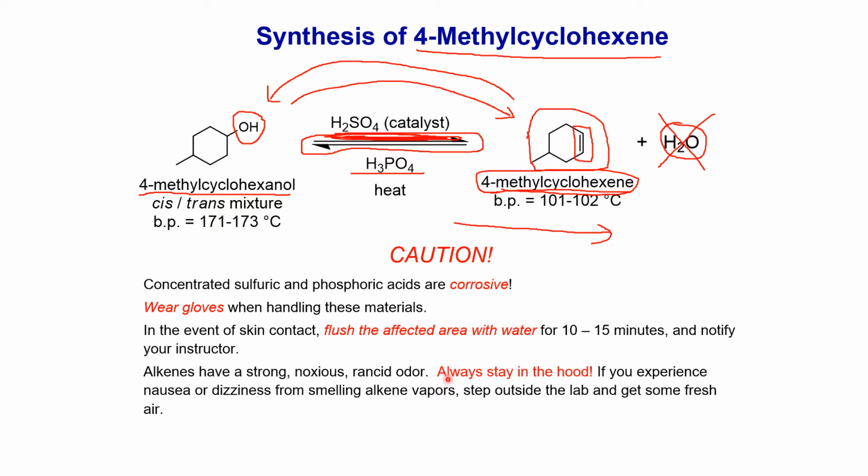Okay, so make sure to set up all the glassware, and when you collect the product, make sure you cap it well and stay in the hood. Okay, work in the hood, right? If you accidentally breathe this vapor, okay, you will get nauseous or dizzy. You quickly step outside of the lab and get some fresh air. Okay, if it's not working out for you, notify your instructor or your TA. Okay.